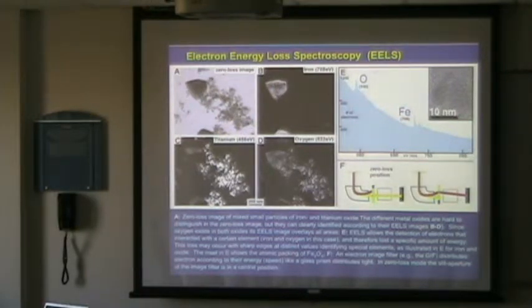But some atoms break down the speed of electrons in a very characteristic way. And this you can use in this case for actually detecting areas which have iron or oxide or something like this. So see here, for instance, we have this kind of energy loss curve, and 500-something electron volt is a typical band for oxygen. 708 is a typical band for iron.